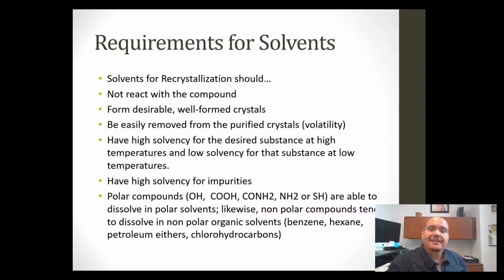And that can happen with some of the unknowns that were given in the past before I got here. The solutes on their own were a little volatile. And then the 95% ethanol was also very volatile. At the end, some students would come back and they wouldn't dry their crystals enough. They would come back at the time of their practicum, their final, and they would have nothing. Like, oh my God, what are we gonna do? Well, they saturated their solute in a volatile solvent and it vaporized away over a week before they came back. So, yes, the solvent should be volatile. No, it should not be so volatile that it ruins your results.